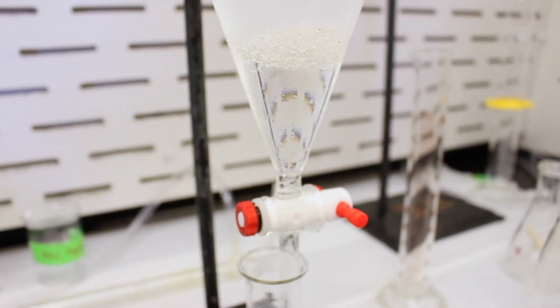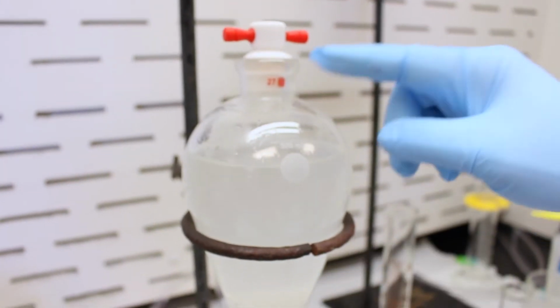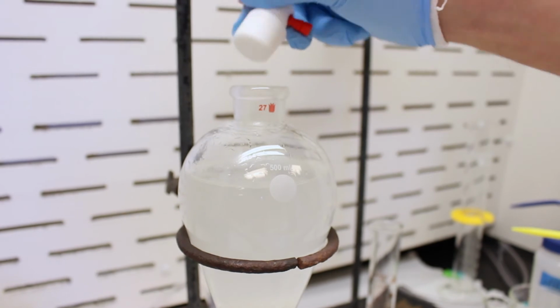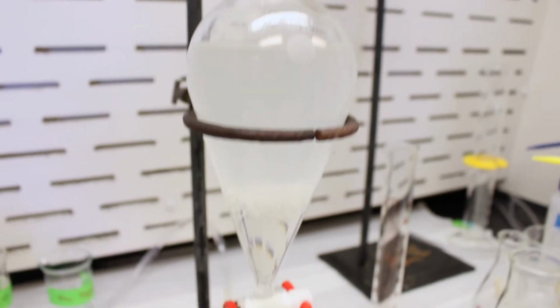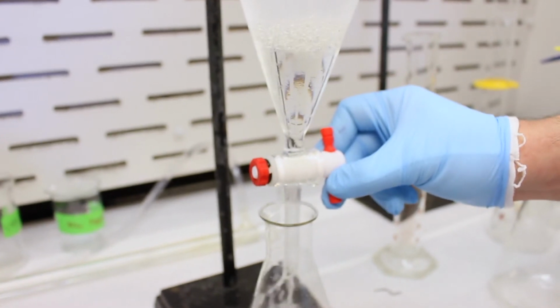Now it's important to not drain it with the stopper in place, because if the stopper is in place, it won't drain quickly because it'll form a vacuum in here. So when you drain, always remove the top stopper. And now we can drain the dichloromethane.